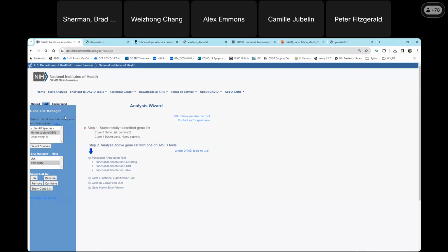And then I'm going to talk a little more about this list manager here. So we have the upload tab that we went through. The list manager is going to show me what species are in my list. Ideally, you want to work on one species at a time because typically, again, your background is going to be chosen from one species, and that's very important for the enrichment analysis statistics.